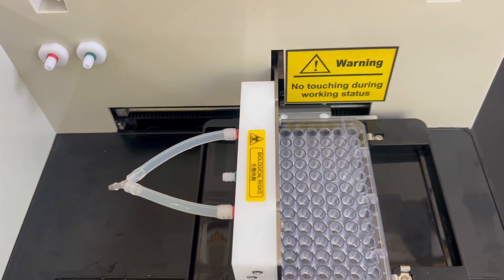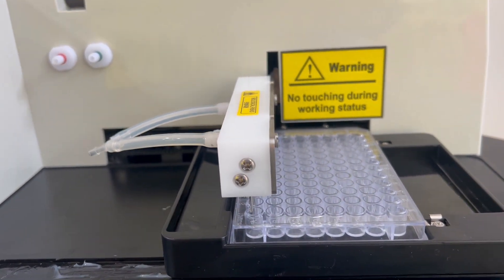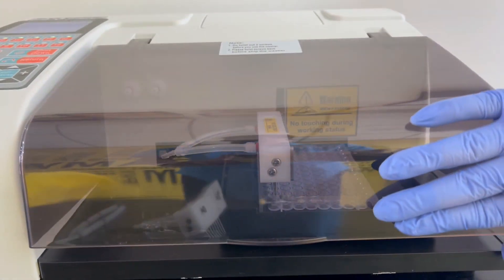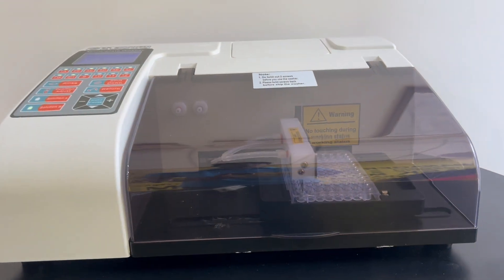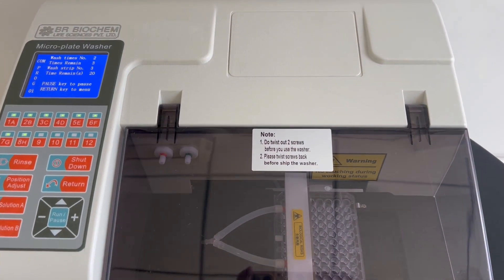Wash times: adjust the wash times from 1 to 99 cycles, allowing precise control and customization for your protocols. Wash lines: select between 1 to 12 lines for efficient washing, ensuring thorough coverage of the plates.